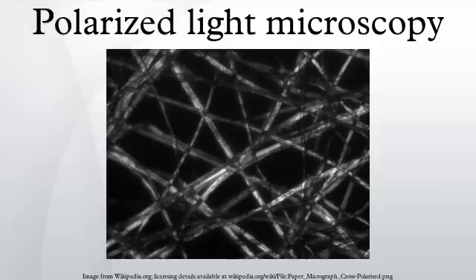This information can be used in a number of ways. If the birefringence is known, then the thickness, T, of the sample can be determined. If the thickness is known, then the birefringence of the sample can be determined.